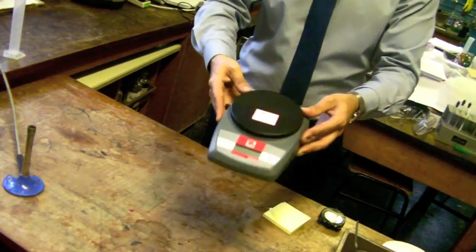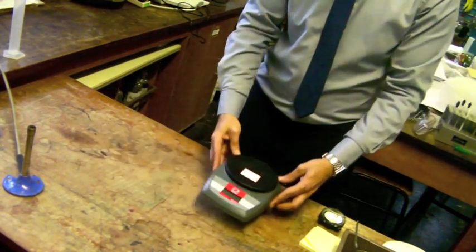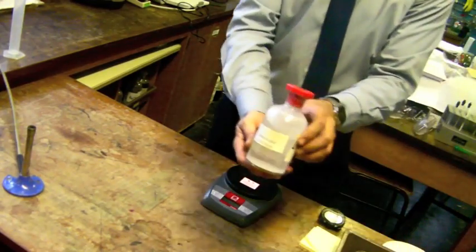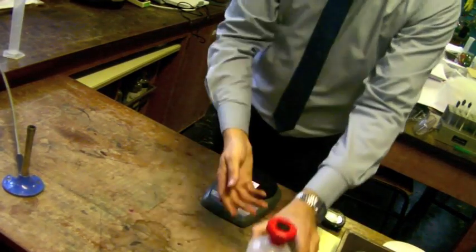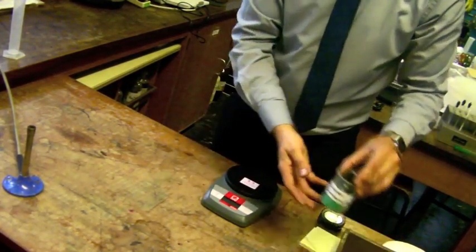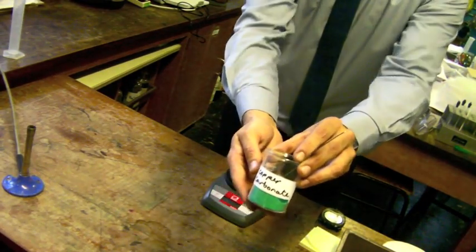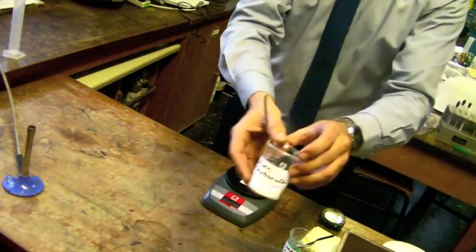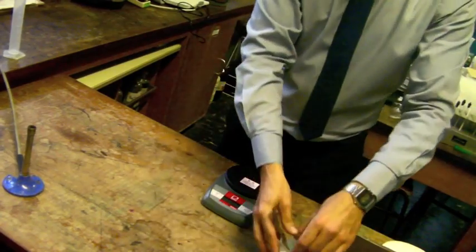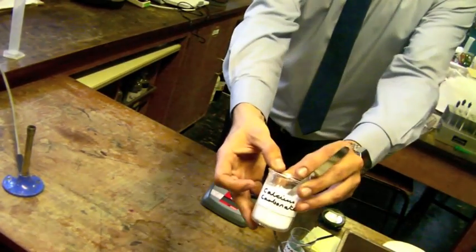You will need an electronic scale, a flask of lime water, a beaker of copper carbonate, zinc carbonate and calcium carbonate.